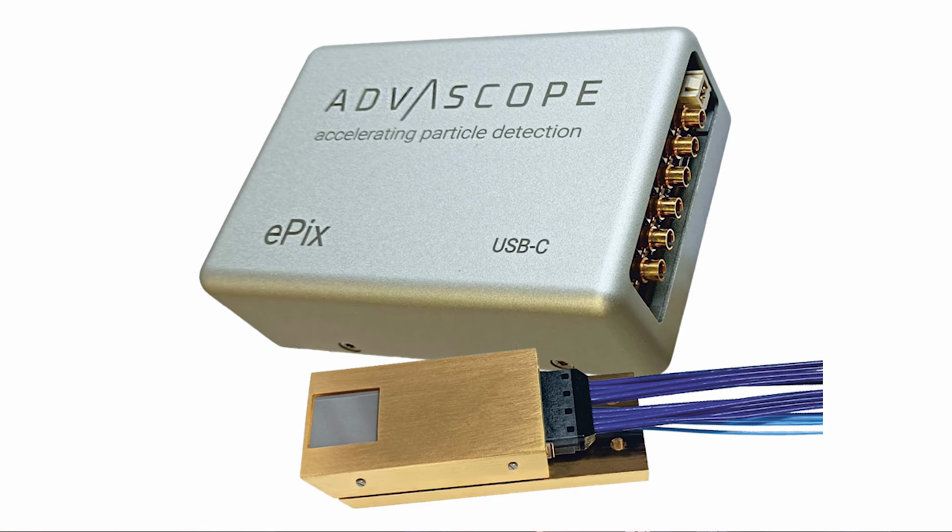Pavel, what role played the Timepix-based detectors in this research, and what device exactly have you supplied? Well, we supplied to the Institute of Scientific Instruments one of our Timepix 3 detectors, which means that it's not just a camera, but it gives you information not only about the electrons in a position manner, but also in a timely manner, which means that you can at the single time detect the position of the electron, the time when it occurred, and also the energy that it deposited in your sensor, which means that it's basically a digital detector.